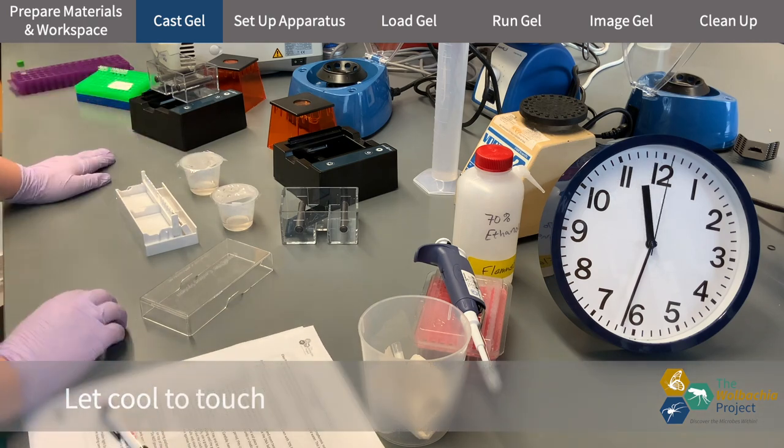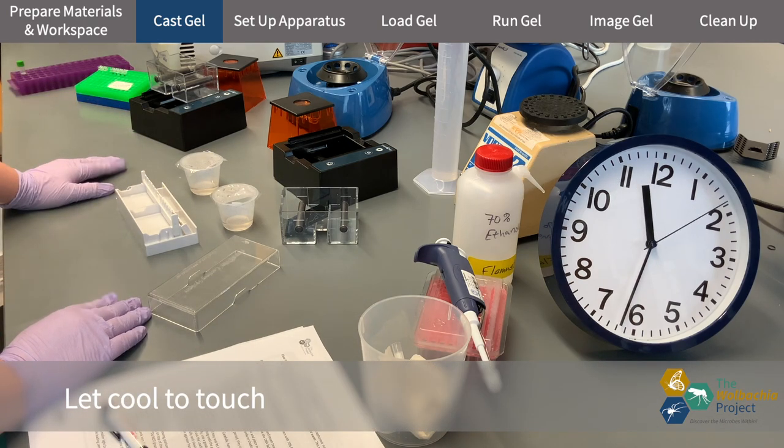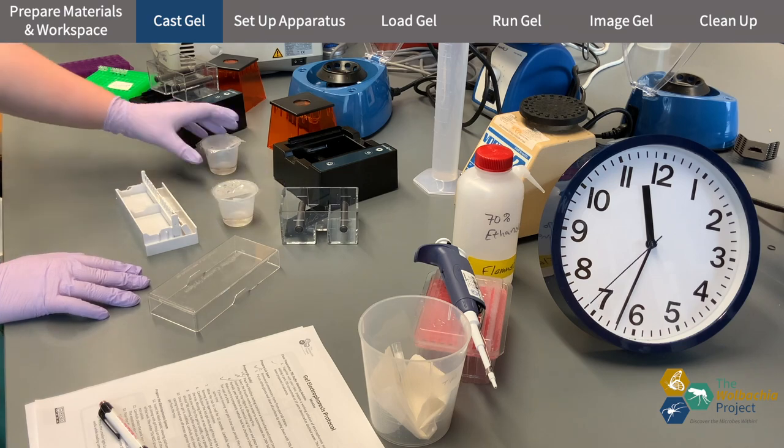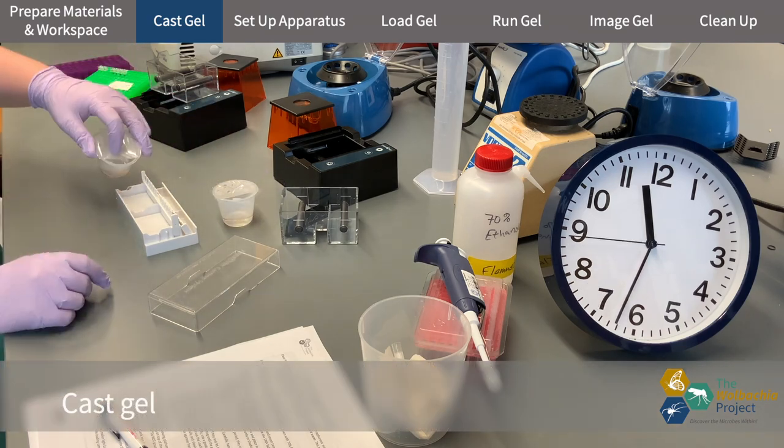I don't want to pour the molten agarose while it is still too hot so I take the time and wait until the agarose cools down. It should be warm but not hot. Then I pour the gel into the casting tray I've previously set up.